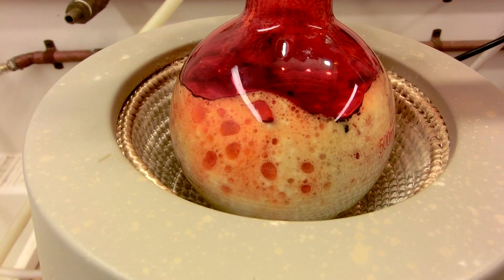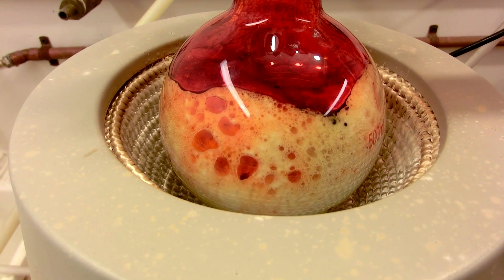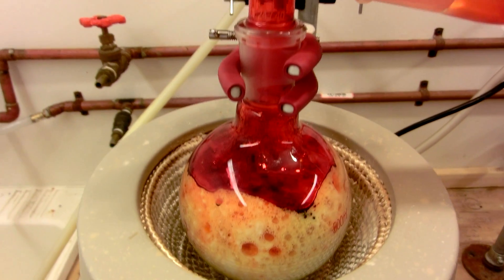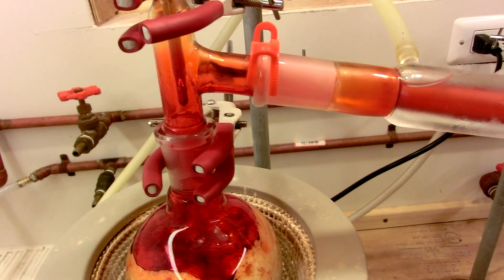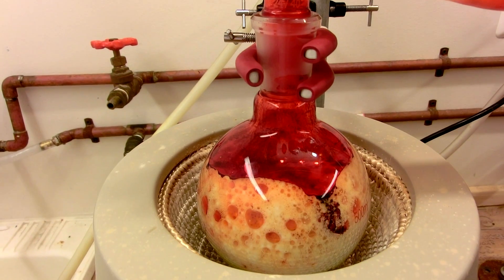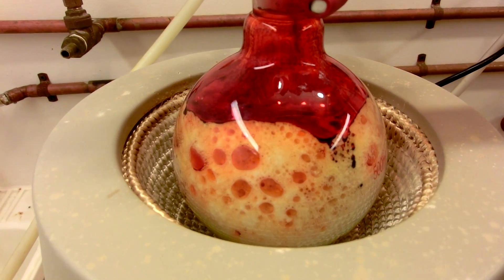As the reaction heats up, it will begin to foam slightly, and a blood red liquid will begin to condense in the condenser and drop into the receiver. This is the chromal chloride. Control the heating to control the foam.